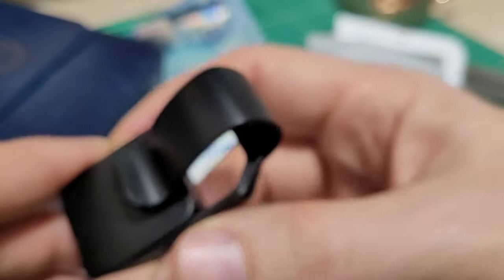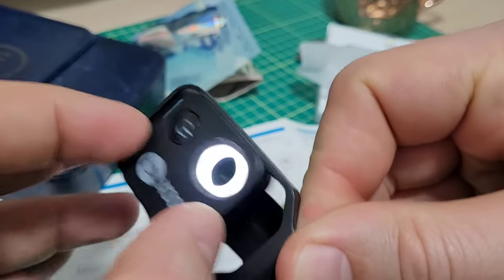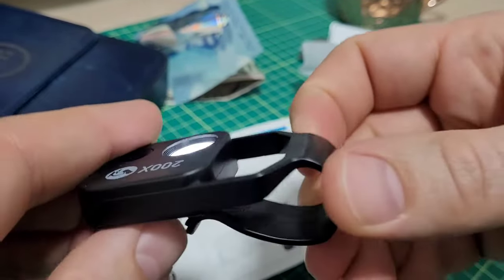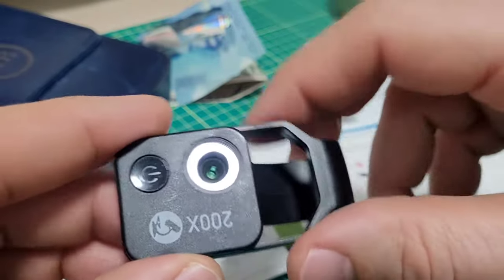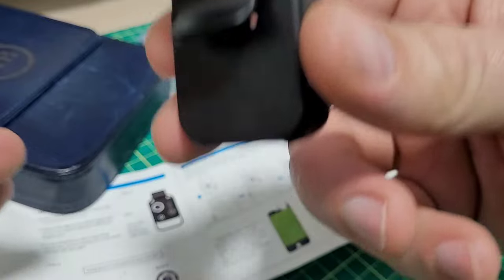It fits pretty much all phones — it's got a little slidey action here, so wherever your lenses are. I can't remember the exact percentage but they said it was like 98% of phones. Let's pop it on here — it takes a few seconds to find it, but you'll have that round circle and then you just adjust it on your phone so you don't have dark spots. You might have one over in the corner — just push it back the other way. You'll get the idea of it, and there you go — it's not obstructed now.